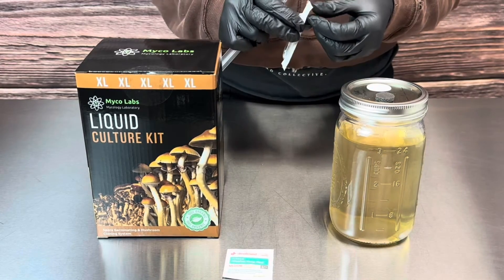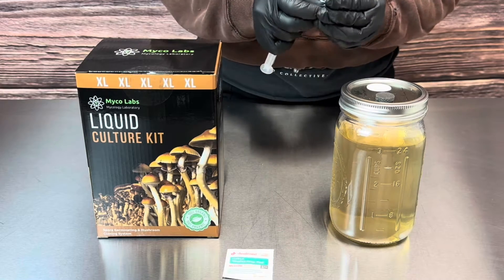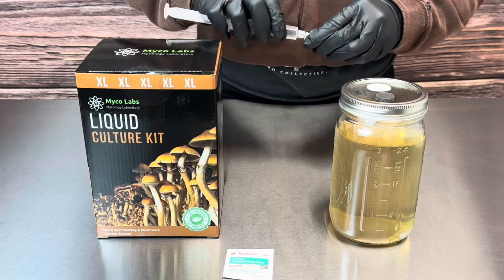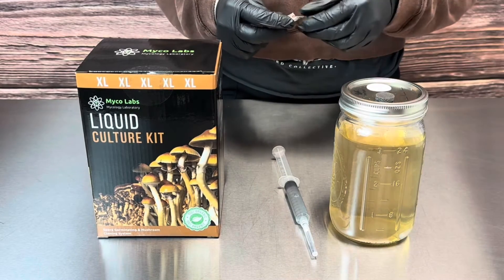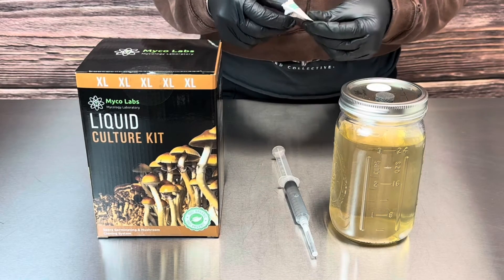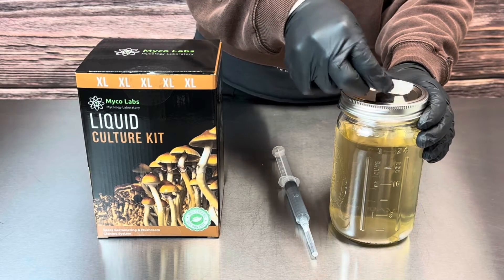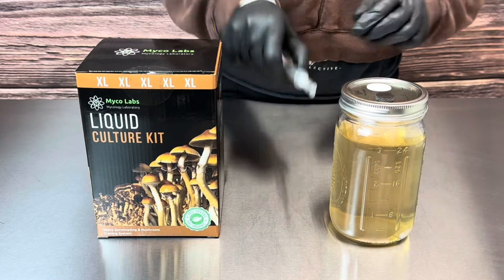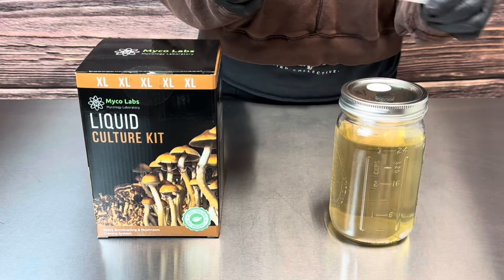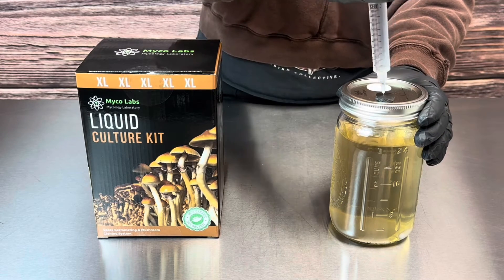Remove the plastic film, take the lock off your syringe, and put one of the 16 gauge needles on the syringe. You're going to want to wipe down the black self-healing injection port. After that, slowly press the needle through the self-healing port and inject your spore syringe.